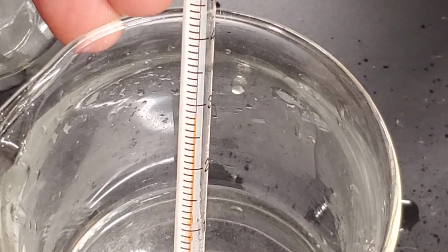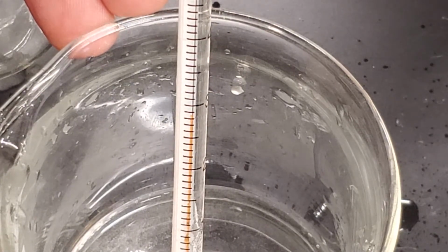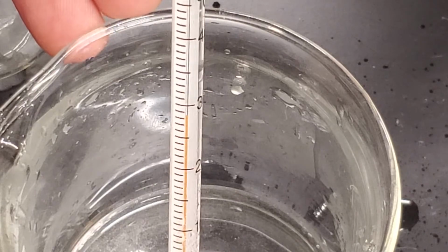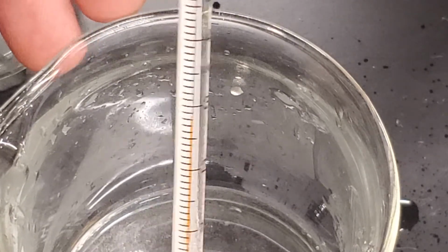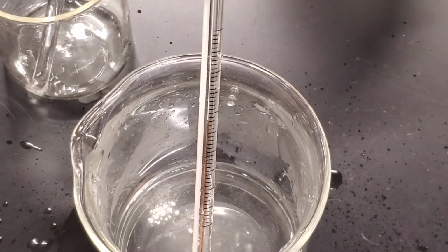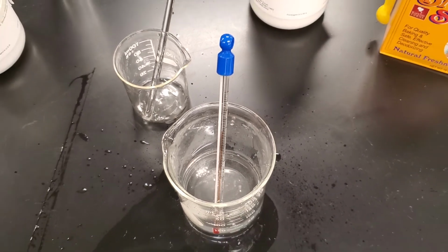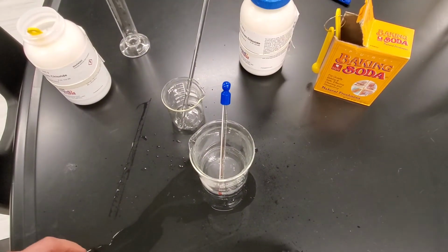And it doesn't appear to be moving anymore, so I might actually be cooling off at this point. So at its highest point, it looks like it was that 1 line below the 30-degree mark. So we just want to make sure that we take that temperature and we record it onto our table. All right, 3 down, 1 more to go.